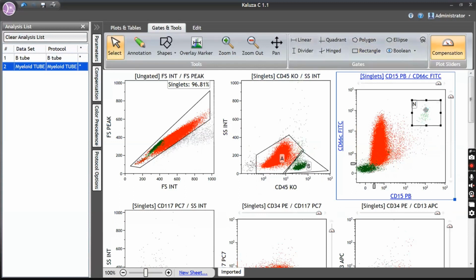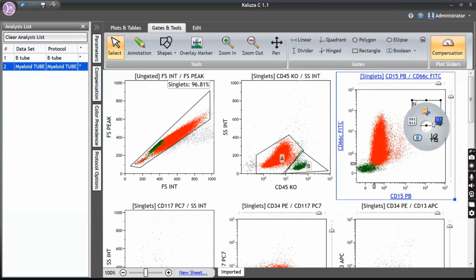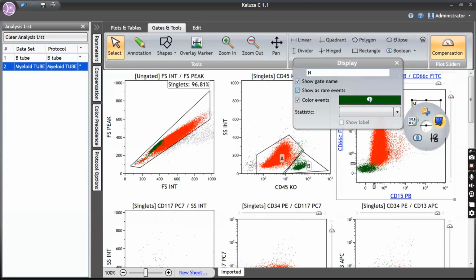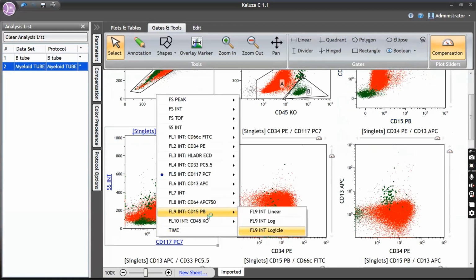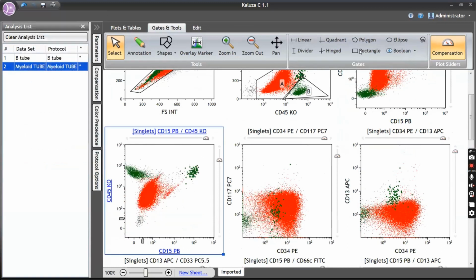See this plot, this is normal neutrophils. It's very few in number, but still I could pick them up with that marker. So that is the advantage here. But still, that's fine. Let's position here.